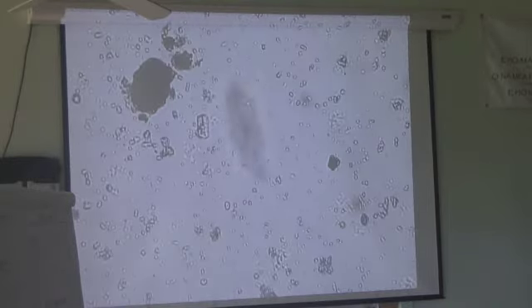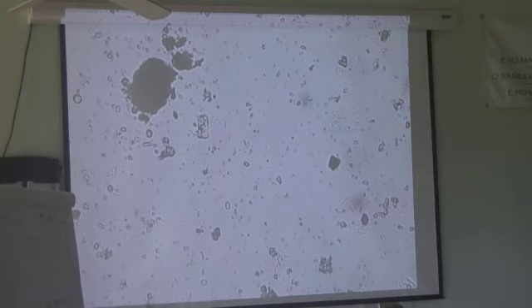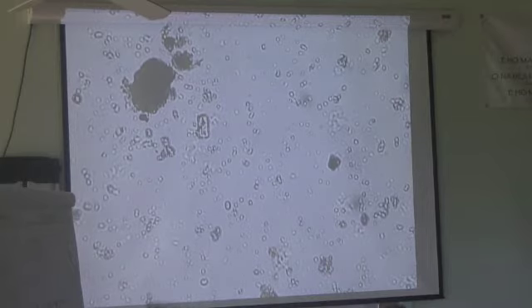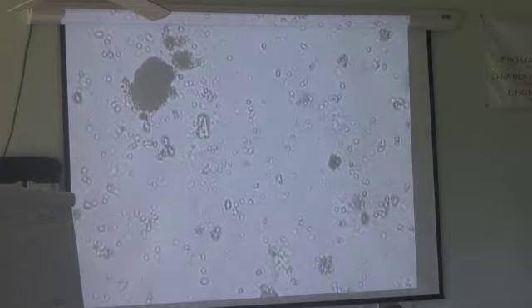So let's go on to the next field. Well, there's a story. We got him fairly square. So, lots of bacteria. Not seeing any flags in here. No amoebae. Yeah, okay, there's a flagellant. So, one flagellant, one is coming bumbling. So, we're going to get a focus. Where are we? So, that guy right there. No, it was something that went zoom. A little bit of sideways motion. You can't really identify the flags when they're silly, but you know, we got one here.